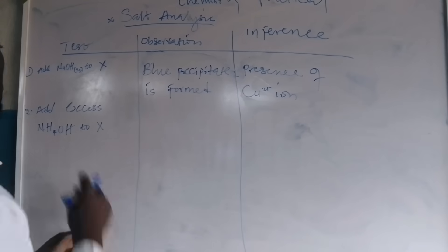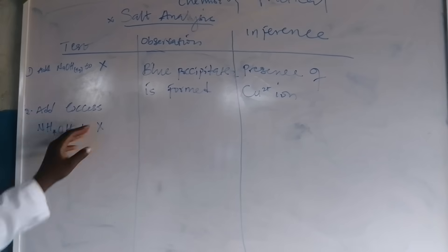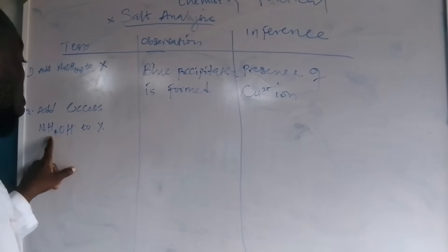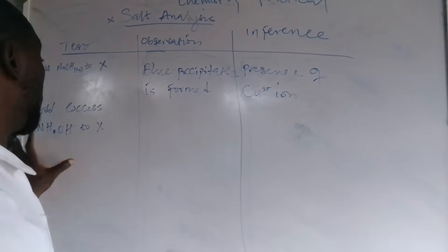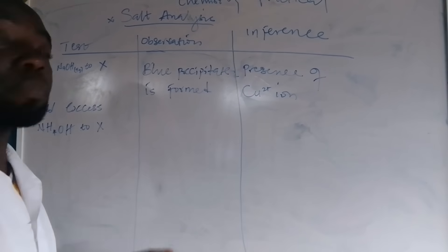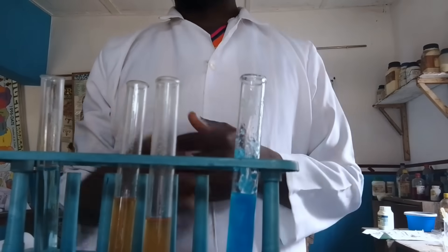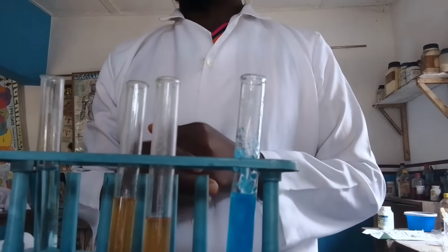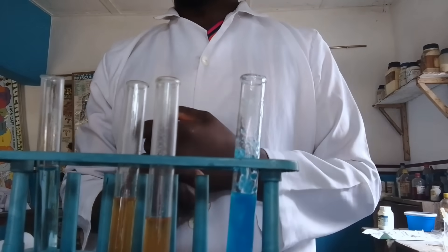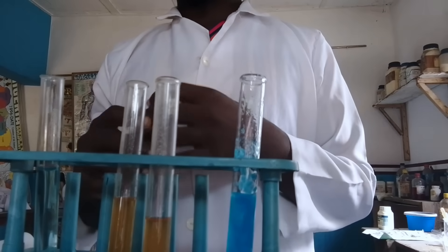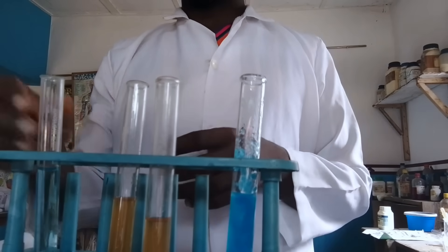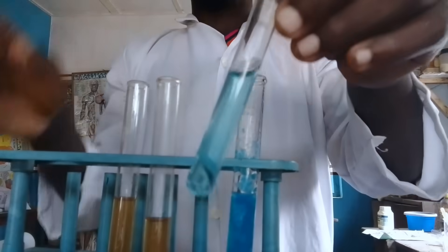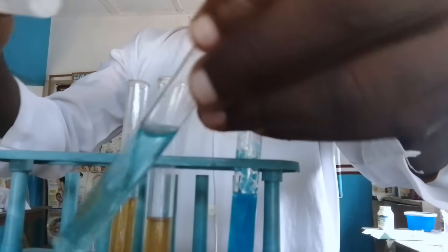Under number two, we add NH₄OH — ammonium hydroxide — to X. Let us carry out the practical. We are going to be adding ammonium hydroxide to copper sulfate and check the observation.